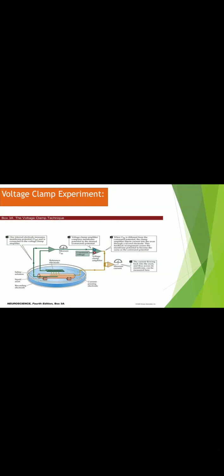If we go back into the history, Hodgkin and Huxley revealed the ion channel event, how there is a change in the current during the action potential, and this change was recorded by using the voltage clamp technique. Both were honored with the Nobel Prize in Physiology and Medicine in 1963. During this period, voltage clamp could only be applied to big cells, meaning they were not able to use this technique on smaller cells.